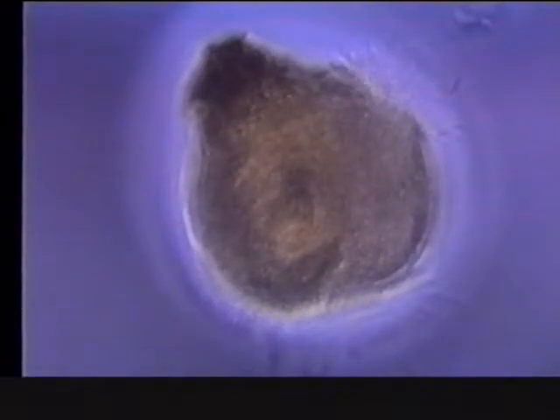And here are some sporangioles which were isolated from the fruiting bodies and placed with a fine-tipped glass rod on the agar. Here is a sporangiole, and it is about to germinate. We will be speeding this up 50-fold now so that you can see the cells coming out. Each of these sporangioles is covered by a hard coat which must be dissolved by enzymes secreted by the cells. And now you can see the bacteria exiting the sporangiole. They've already germinated, obviously, and they're coming out as a small population.